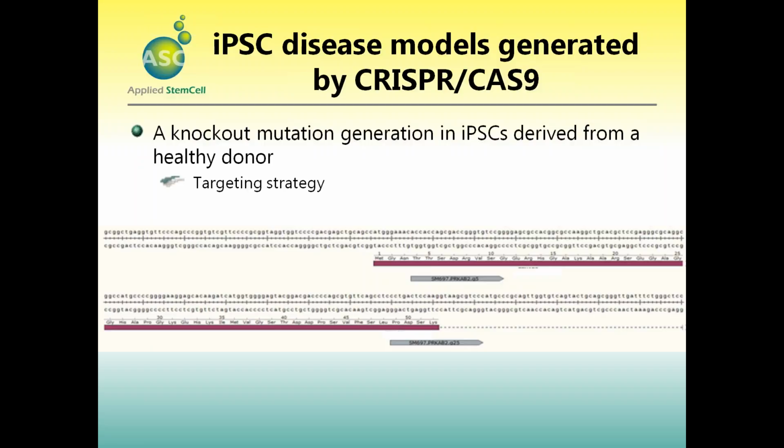When we are working on cell line evaluation, we usually start the guide RNA design, construction, and validation at the same time. So we chose at least 2 guide RNAs with the best off-target profile to test in human cell lines. This is to ensure that the guide RNA works for the human genome.